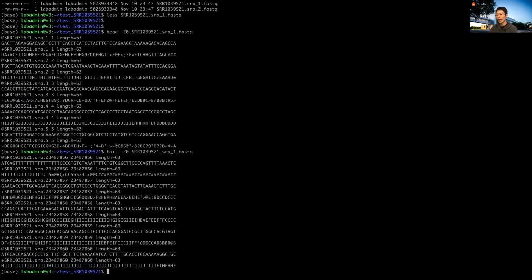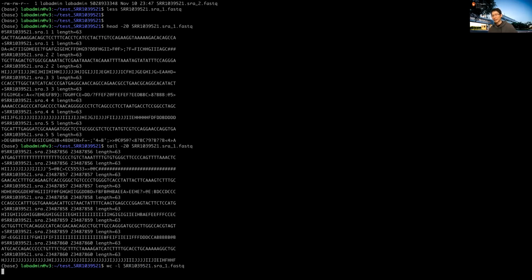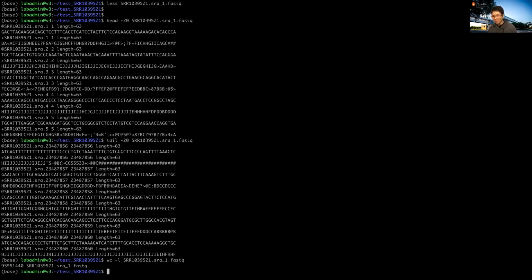If you want to know how many lines there are in a specific file, you can do wc -l. wc means word count, I think, and -l means lines. I'm not sure how long it takes on our machine. Let me try first. You guys can hold a bit. So it tells you how many lines we have. Oh, that's fast.